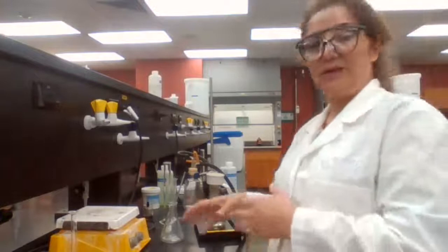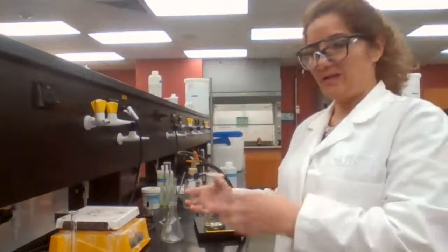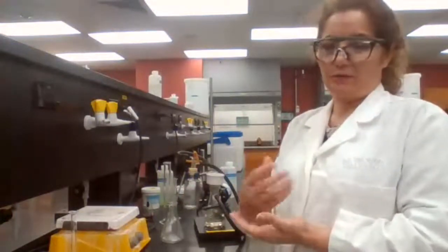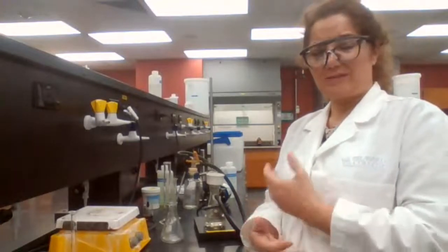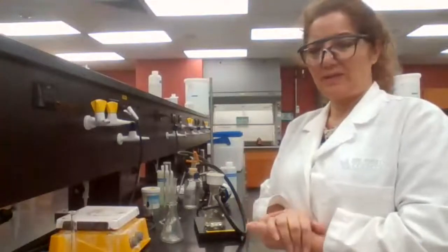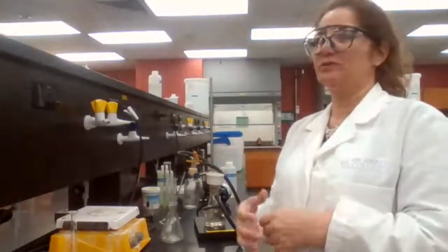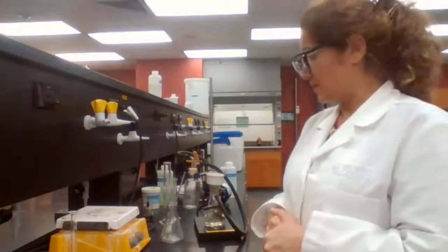I don't know how many of you noticed, but I had a very tiny sample in another watch glass. I placed it in the oven, so that sample is going to dry first. I can get busy with the melting point. As soon as that tiny sample is dry, I can start measuring the melting point and wait for the large sample to dry completely before I can get the mass for the top.